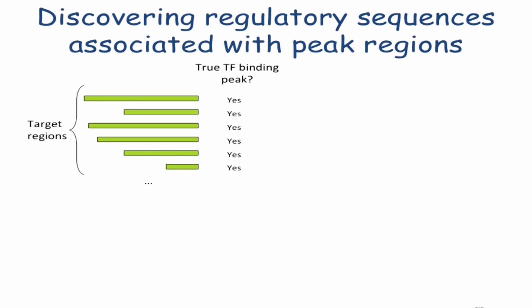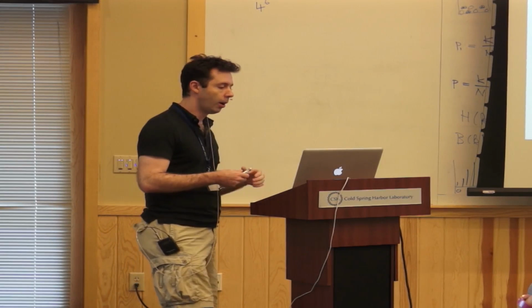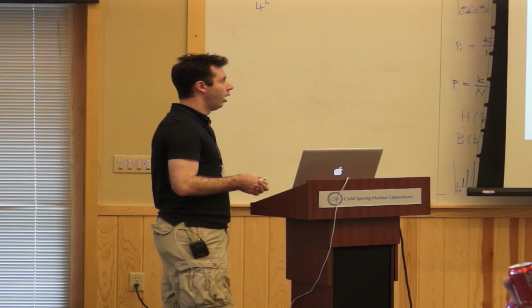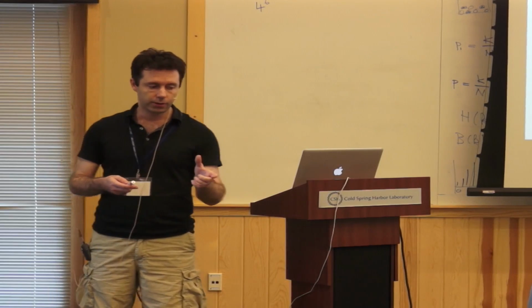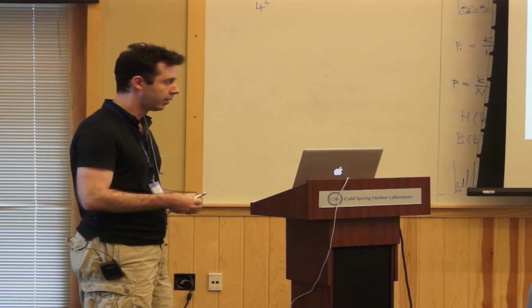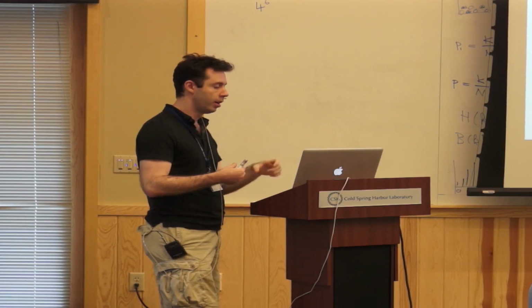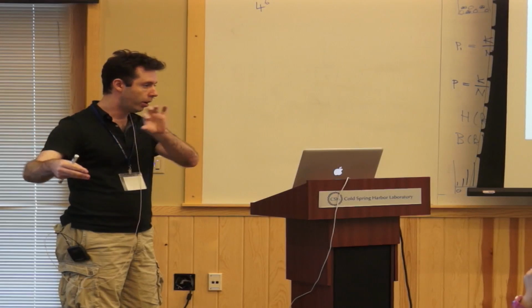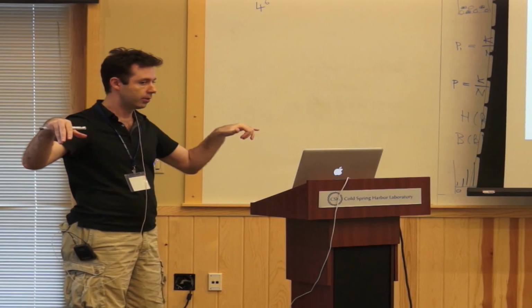You want to discover what's in your sequence, what's highly abundant in terms of short sequence, short motifs within your peaks, right? The key aspect about this type of analysis is to define the problem in a very careful manner, right? When you say, I want to find short sequences that are highly enriched in my peaks, you have to define what you mean by enriched. Usually enrichment means that you're going to compare your peaks to another set of locations in the genome, and you want motifs that are more abundant in your peaks compared to these other locations, right?